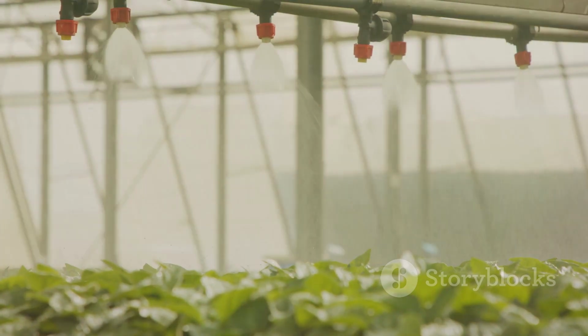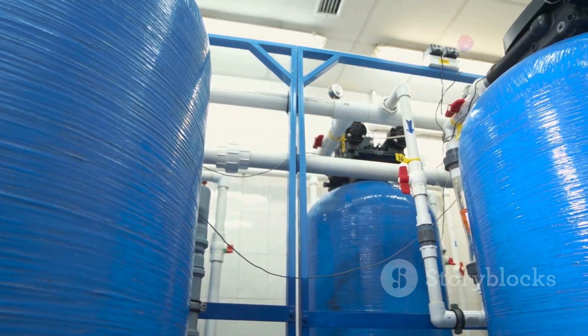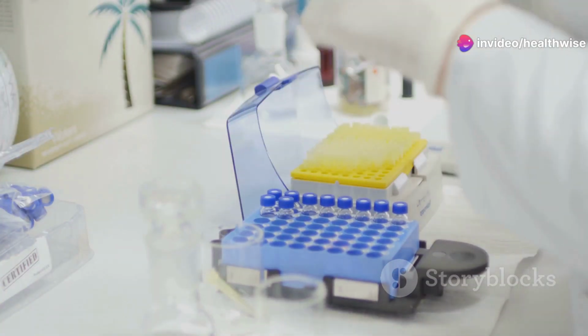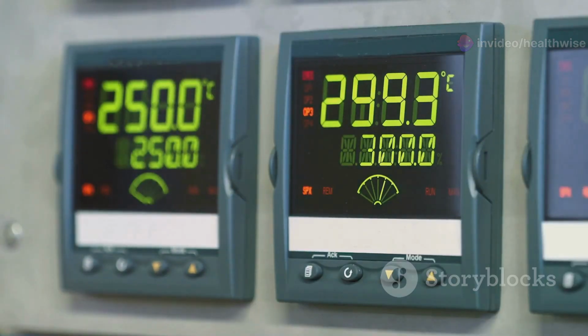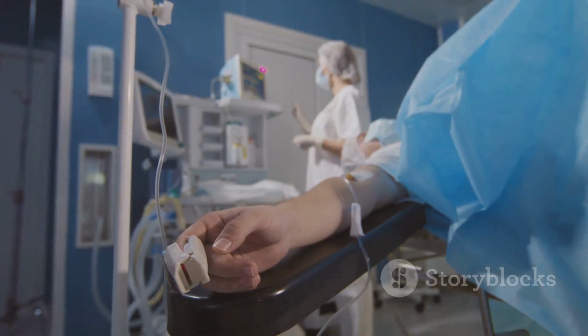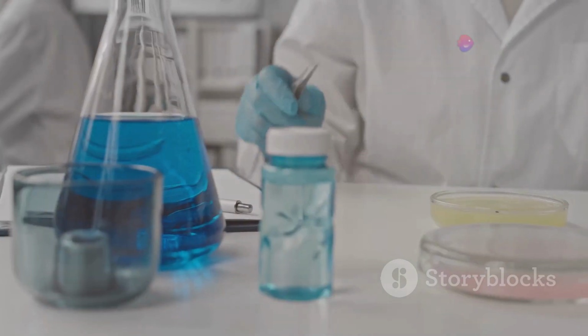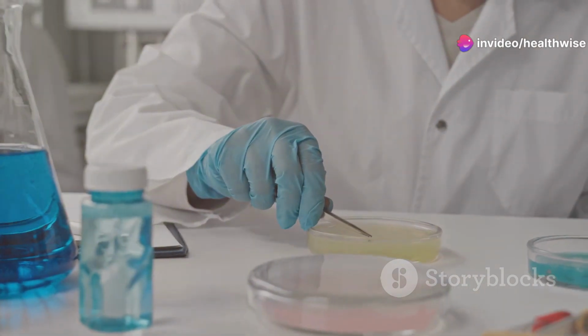Humidity control is equally important. Most incubators have water reservoirs or humidifying systems to maintain the required moisture levels. This is particularly crucial for certain types of cell and tissue cultures. Gas concentration is another key factor. Some incubators can control the levels of gases like carbon dioxide and oxygen. This ability is vital for growing specific types of cells that require precise gas environments.